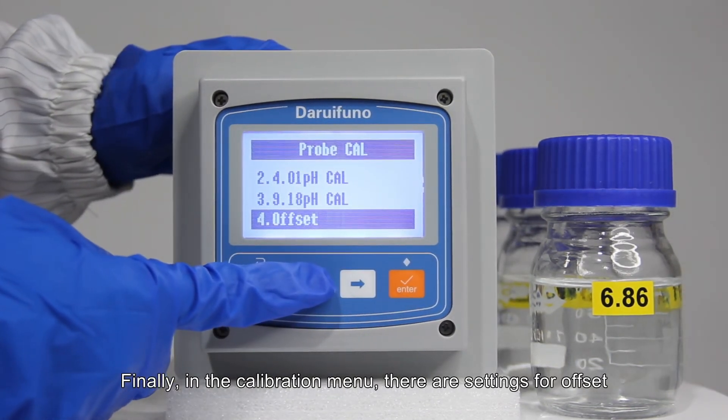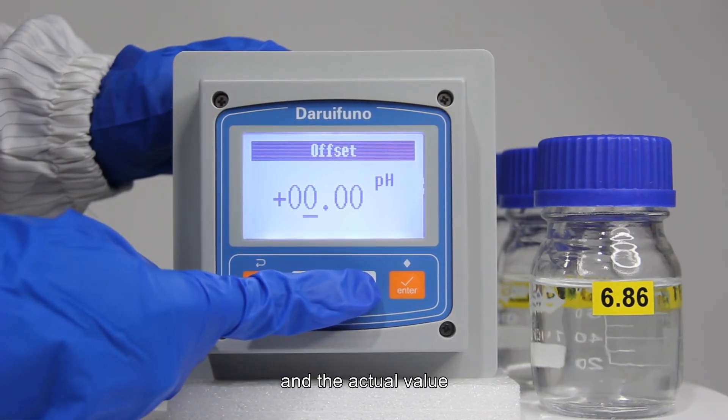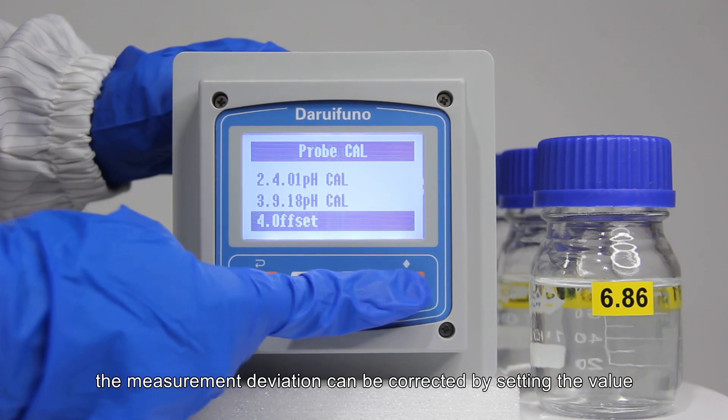Finally, there is offset setting. If there is a fixed deviation between the probe measurement value and the actual value, the measurement deviation can be corrected by setting this value.